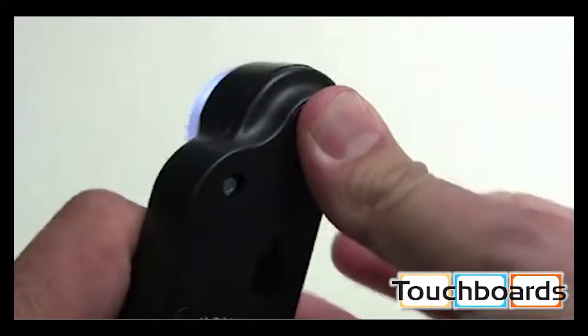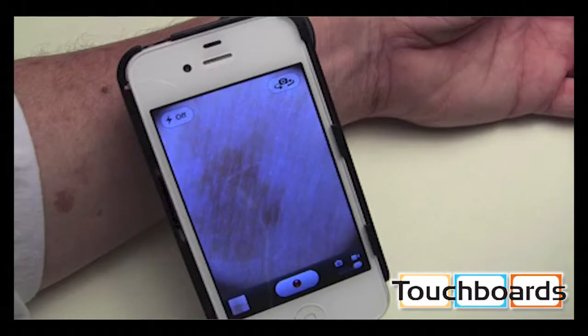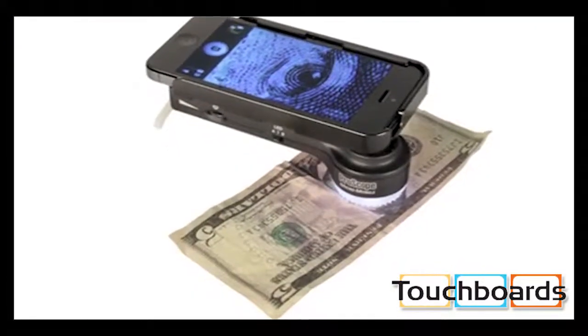Our lens acts as a magnified relay for your mobile device lens, so the distance relation between the two is within just microns to produce a sharp image with perfect color reproduction.